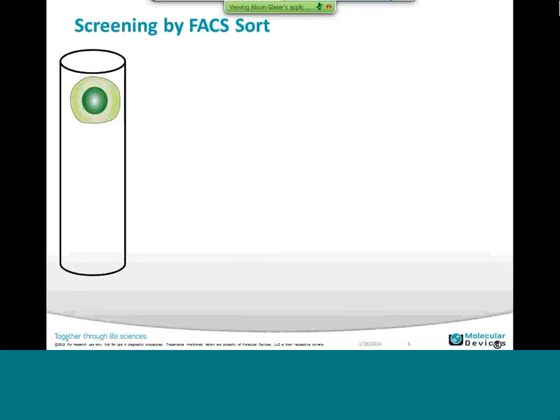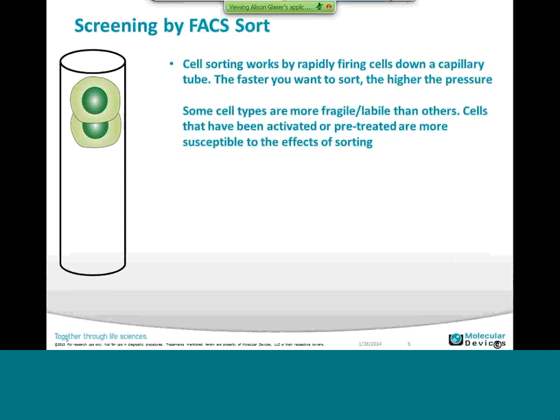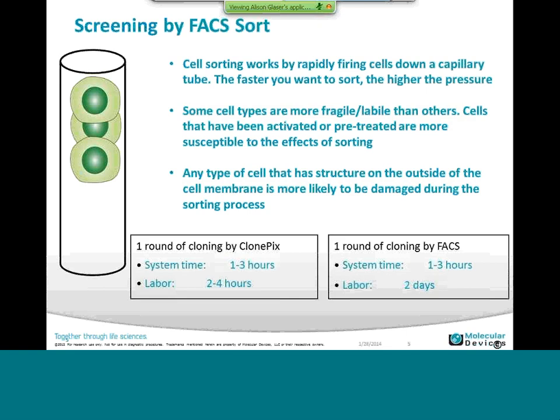Well, let's take screening by FACS. While there are advantages to FACS, cells are fragile to the high pressure required by firing down a capillary tube. It would be beneficial to have higher cell viability after spending all that significant amount of time and resources that are required by the use of a FACS system.